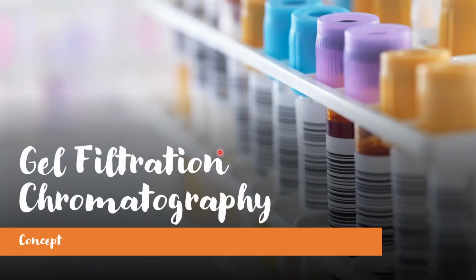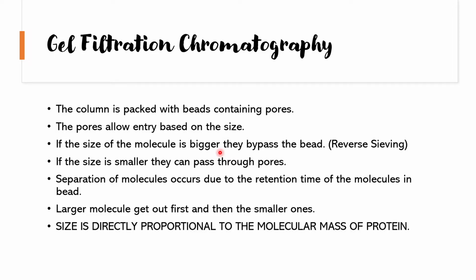In this particular video, we are going to talk about the gel filtration chromatography concept. From our previous video, we know that gel filtration chromatography is based on size. In gel filtration chromatography, the column that we use is packed with beads containing pores, and these pores allow entry based on size. If the molecule is bigger, it simply bypasses the bead, and if it is smaller, it can pass into the pores.